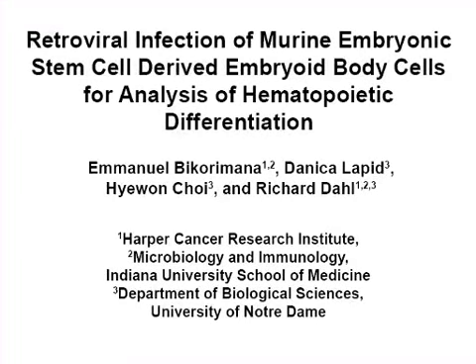The overall goal of this procedure is to examine how expression of a gene at different times during differentiation of embryonic stem cells affects hematopoietic differentiation.